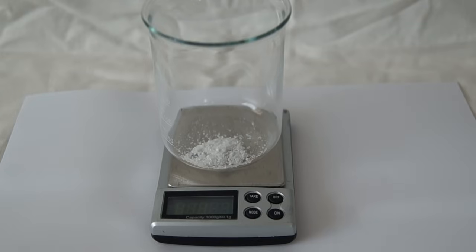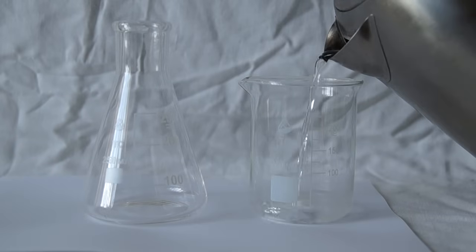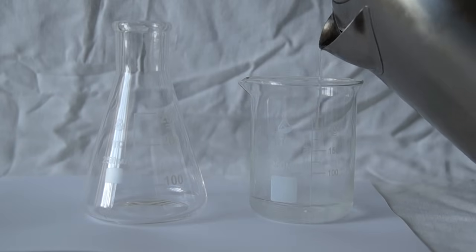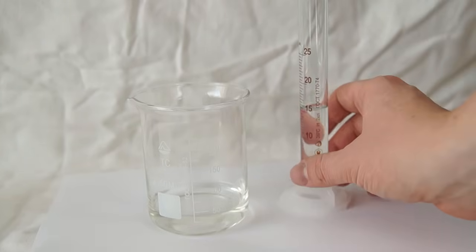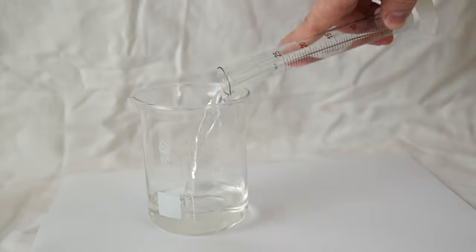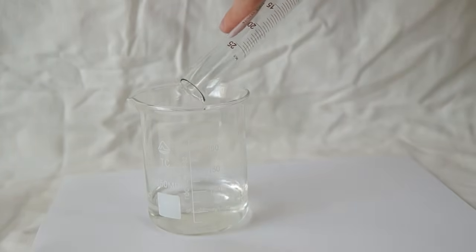To begin we need to weigh out approximately 2 grams of glucose and dissolve it with a small amount of hot water. Next we add 10 milliliters of sodium hydroxide to the solution of glucose.